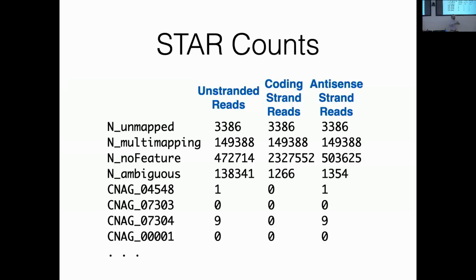But all those different methods produce data that fall into two different groups. One group is that the sequence you see matches the mRNA sequence. So if the mRNA sequence, as you predict from the genome, is GCGATGC, then the reads will actually have that sequence.